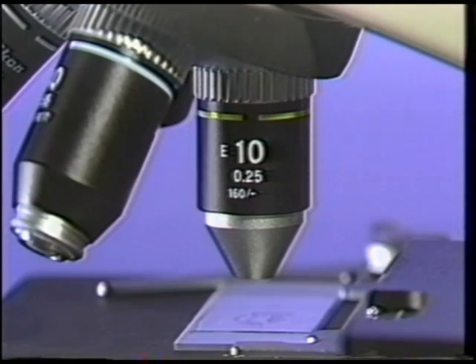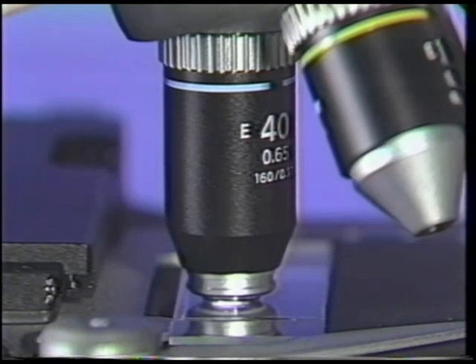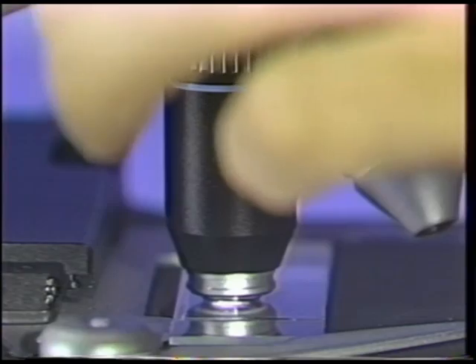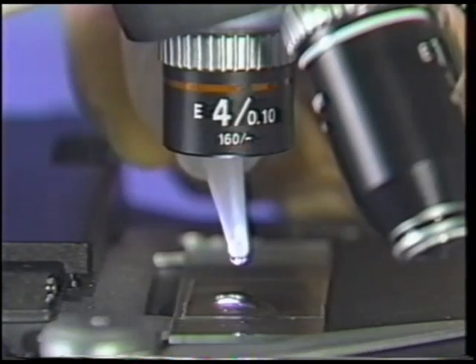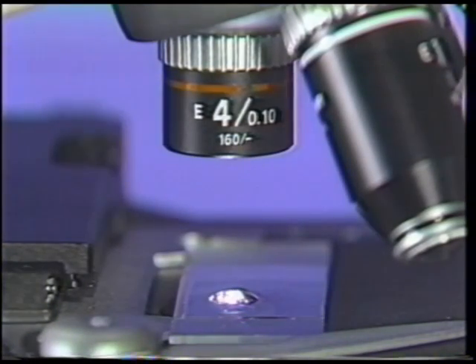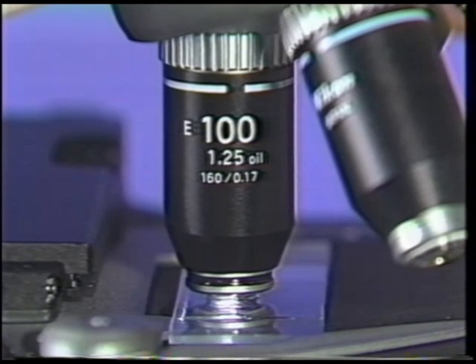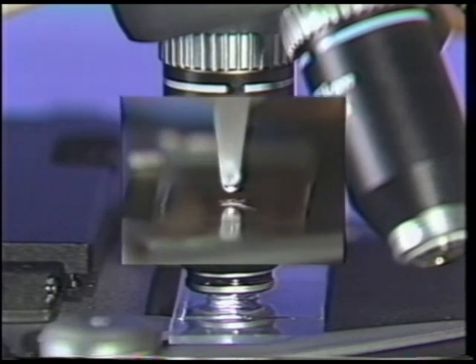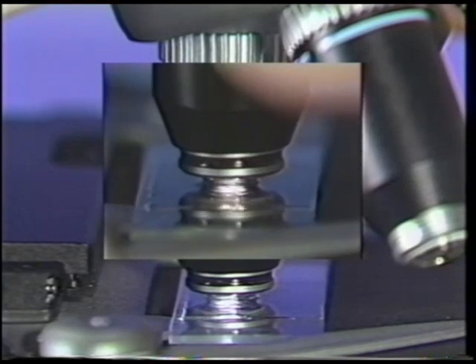Use the 4X or 10X objective to select the viewing area. Rotate to the 40X to narrow down the specimen area. Now you are ready to use the 100X oil immersion objective. Rotate the 40X objective out of the light path. The beam of light illuminates a small area on the specimen. Using this as a target, remove air bubbles from the tip of the oil bottle and place a drop of oil on the slide. As you watch from the side of the microscope, rotate the 100X objective directly into the oil without allowing any dry objectives to contact the oil. Moving in from the side rather than directly from the top prevents the possibility of air bubbles becoming trapped between the objective and the immersion oil.